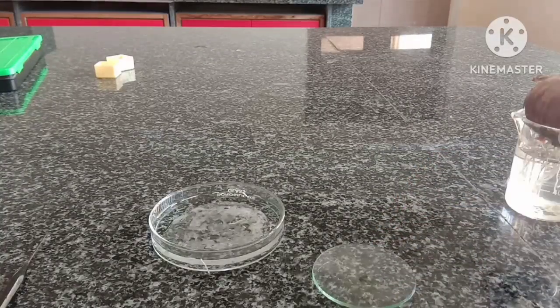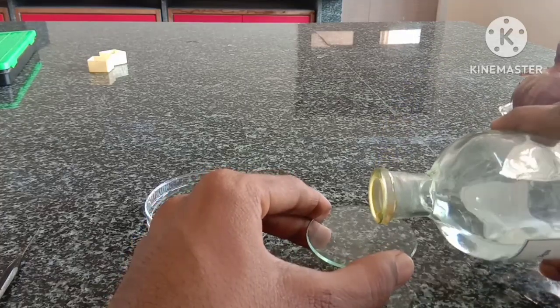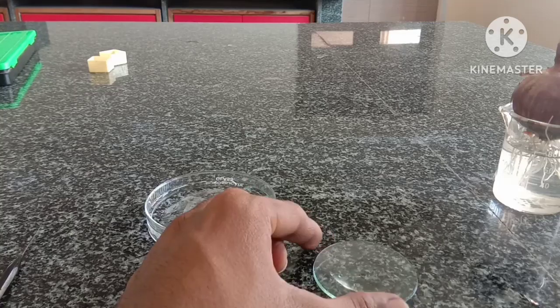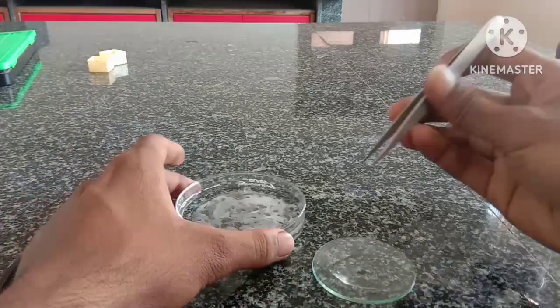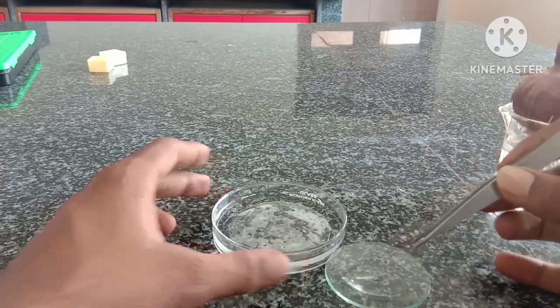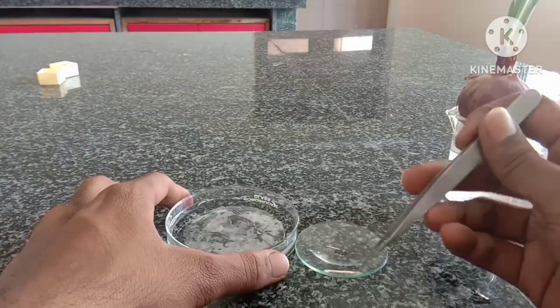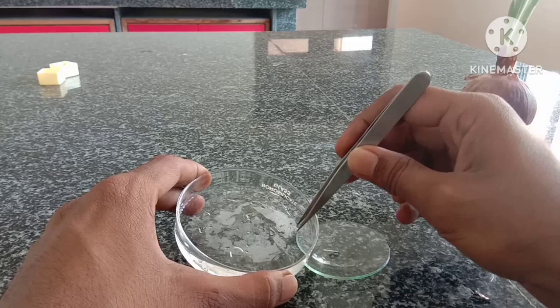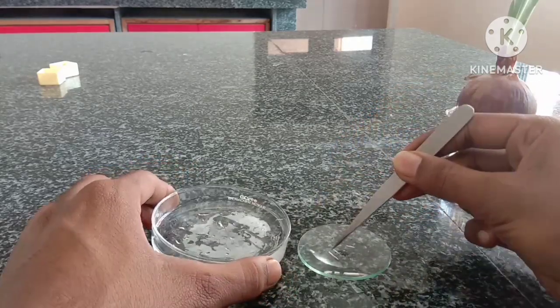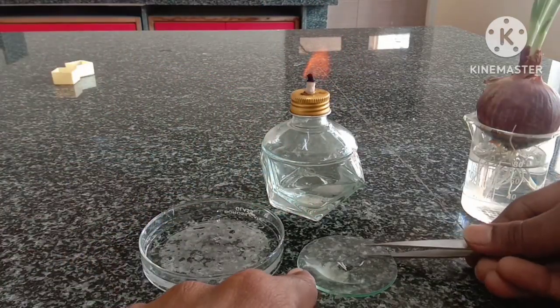Now take one normality HCl in a watch glass. This is one normality HCl — this much is okay. Now transfer the root tips to that watch glass containing one normality HCl. We are using HCl here to dissolve the middle lamella present between the cells. Now warm it on a spirit lamp for a few seconds.